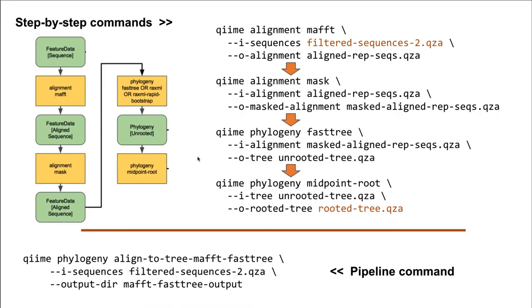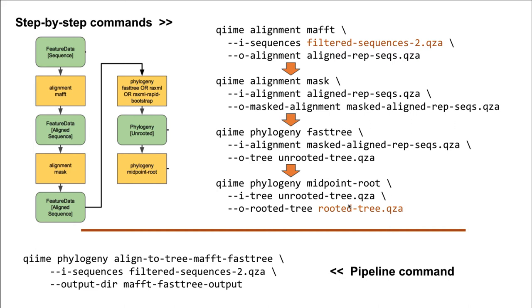Let's quickly recap what we just ran through in the Galaxy interface. We ran the AlignToTreeMafftFastTree pipeline, which essentially ran these several individual QIIME commands in order, from making the alignment, masking the alignment, running FastTree, and then rooting that tree.